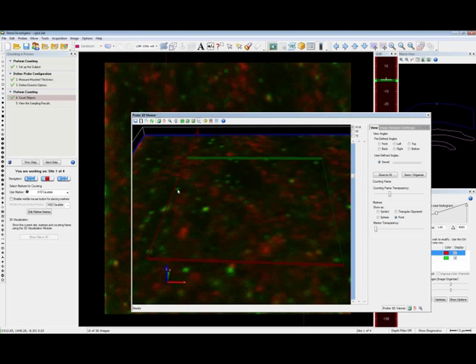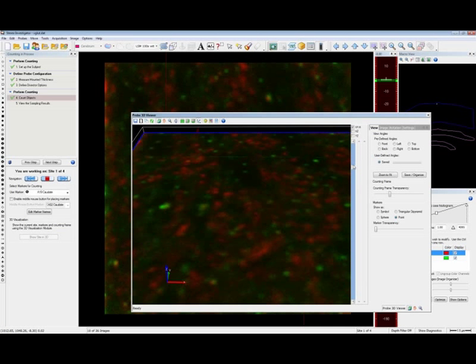Right. So, for example, if you were looking at this synaptic element and you wanted to say, all right, does it come into focus when it touches the exclusion line or not? Let's move through Z and see whether or not that is the case. And so we're out of the dissector right now, and we can see that it is there. So as we move down, right, we wouldn't mark that object. So it's just an additional tool to allow you to make these decisions more rapidly and with greater confidence. Right.